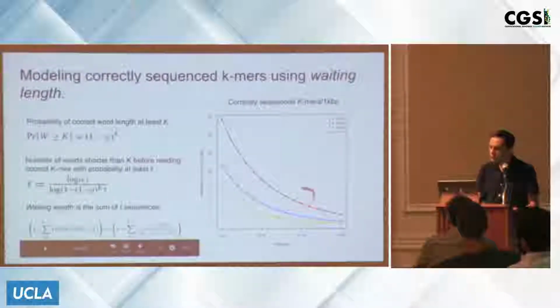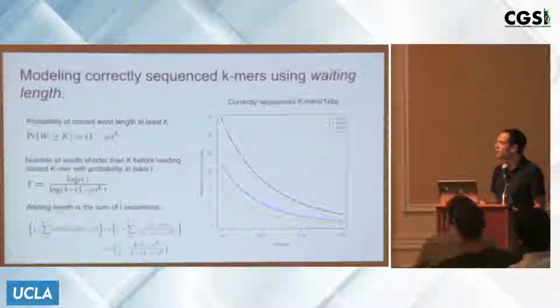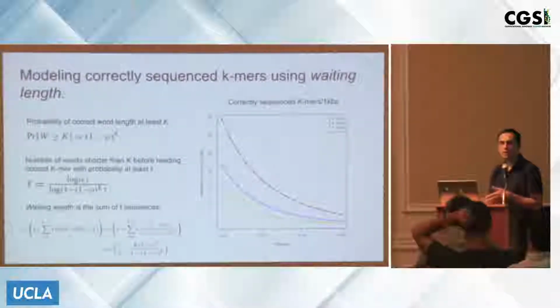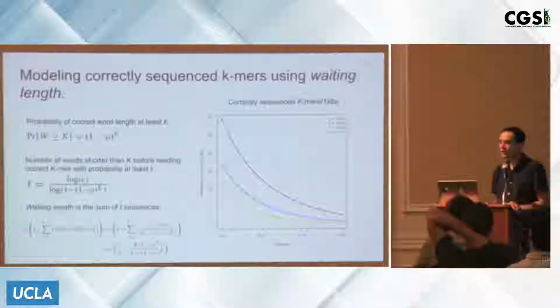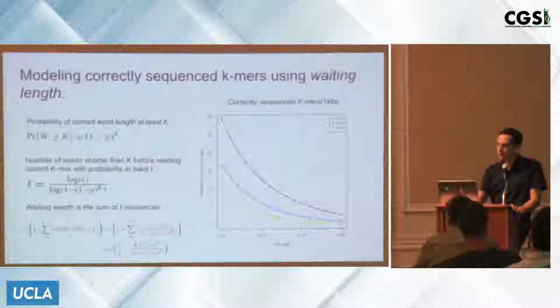But fortunately now, because the error rate is hovering between 10 and 15%, we're starting to see a fairly appreciable fraction of spans of fairly long length that contain correctly sequenced words. So that means that we can have fairly different design parameters between what we have used in the past for detecting matches between single molecule sequences and genomes, and what we're currently using to detect exact matches.